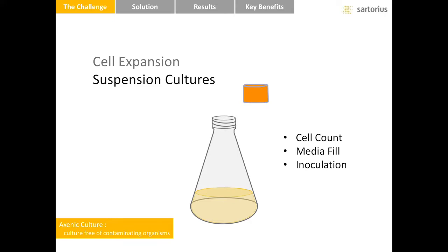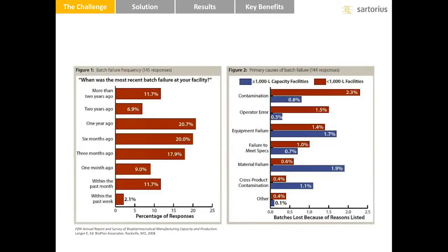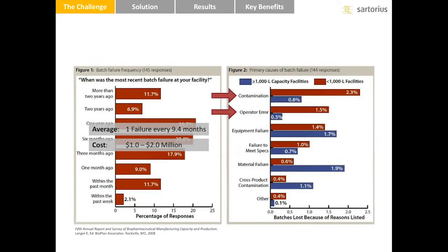Because the flask is opened, there is a real danger of contamination. Contamination means the expansion process is abandoned and the culture is thrown away. A Bioplan Associates survey inquired about the frequency, cost, and leading causes of batch failure. On average, a failure occurs every 9.4 months and costs 1 to 2 million dollars. The leading causes? Contamination and operator error.